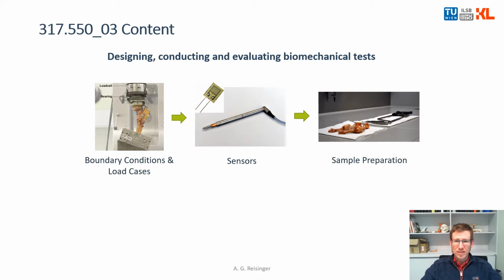Sample preparation is also important, right? Because the sample usually has soft tissue around the bone, and you have to think about whether you would like to keep it or dissect your sample in some way. But a reminder, sample preparation will be left out this year in this theory session.